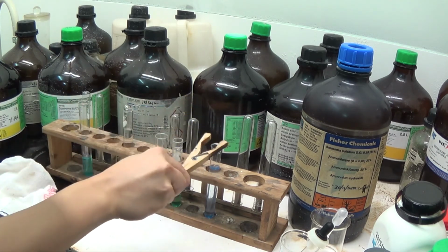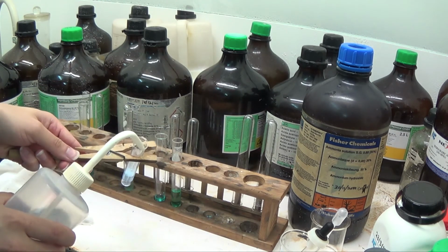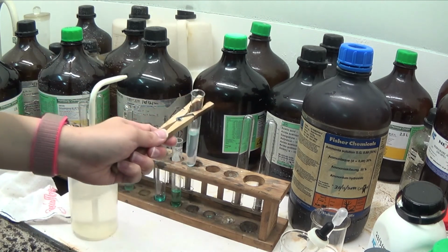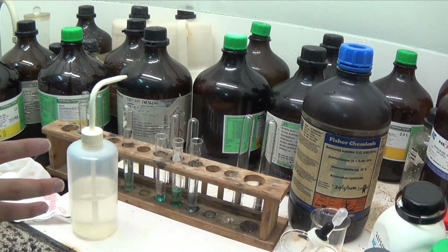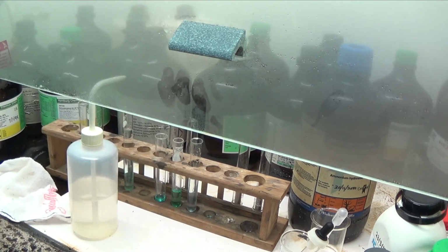Okay, I'll see if I can actually put a lot more water and see if I can get it. Yeah, it kind of goes really pale blue solution now. Okay, so that's it for copper 2 plus chemistry. We'll probably stop here for the time being because it's not very comfortable with the mask and all these dangerous toxic fumes, especially in this non-ventilator fume hood.